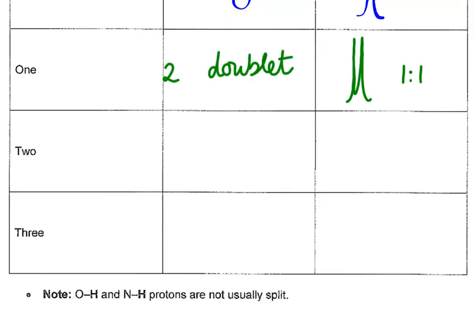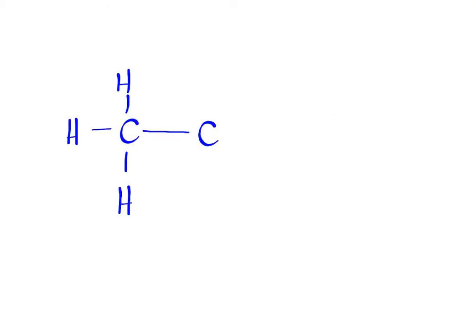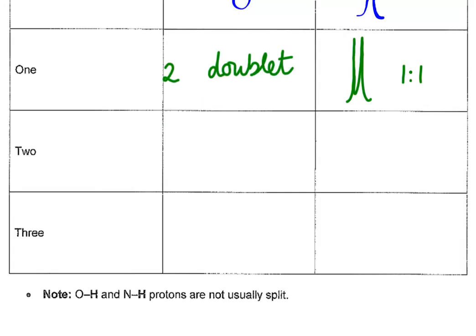Let's now look at an example where the number of adjacent protons is 2. Again, we'll start with a methyl group, to give them 2 adjacent hydrogens. You can imagine this is going to be fairly common now, so every time we have an ethyl group, the number of neighbouring protons is 2, so our n+1 now comes to 3, and this signal is known as a triplet, so there will be 3 little peaks that make up the signal, and they are in a 1:2:1 ratio.